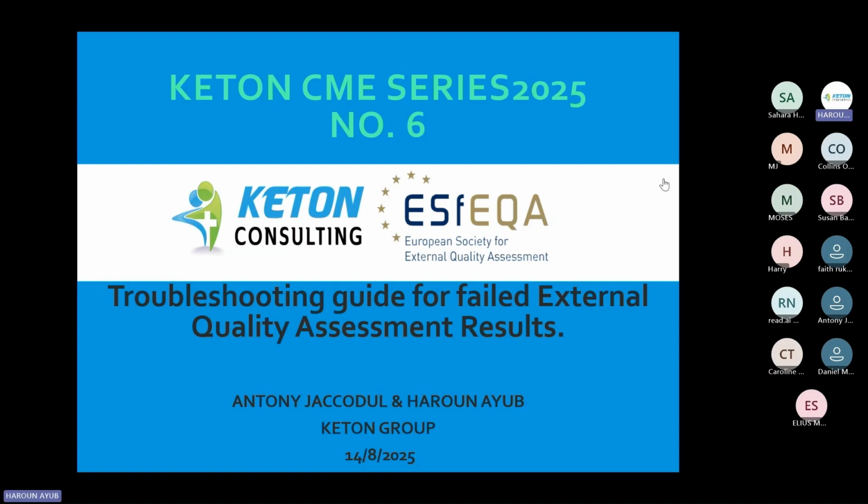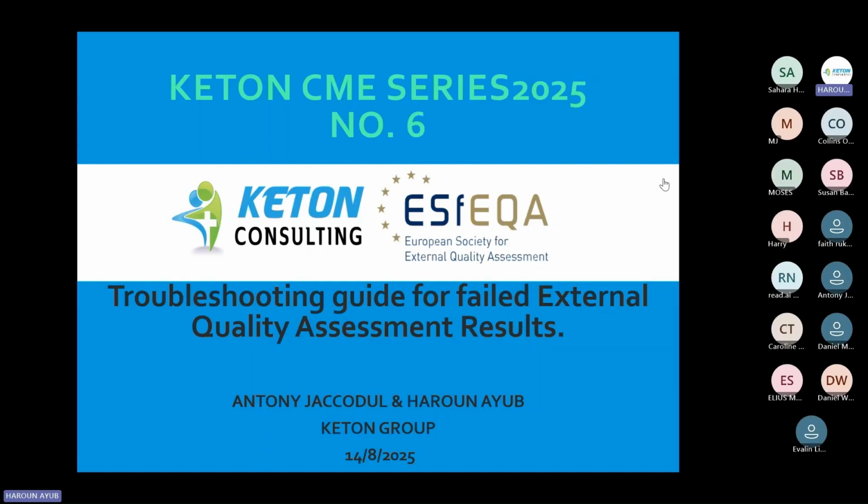We'll be going through a troubleshooting guide for failed external quality assessment. For this particular guide, we'll go through what the expected results are that you need to get, what the indicators are that show the EQA has failed, and we'll be asking questions on what happens if the results are a particular way, and how we'll be able to troubleshoot.